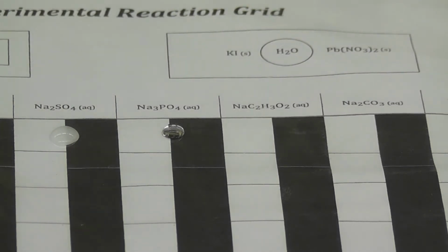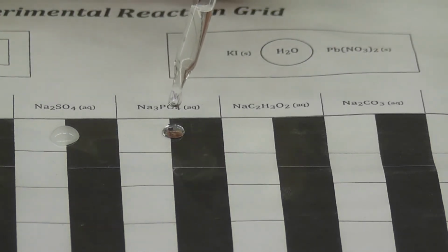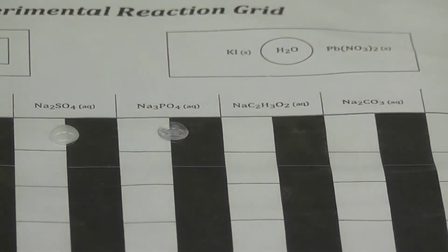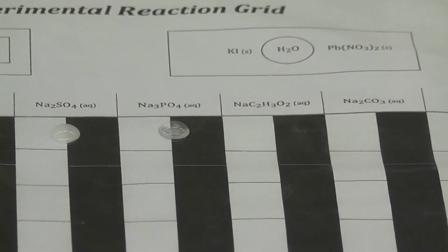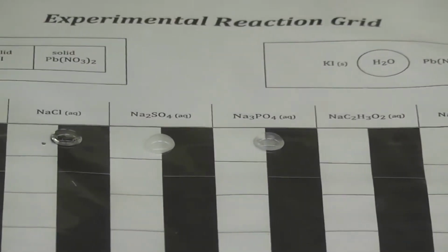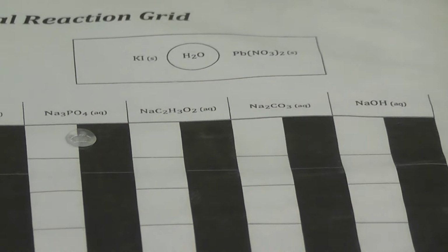And then this time we're using the sodium phosphate. So now I'm going to add 1 drop of sodium phosphate to the lead-2 nitrate. 1 drop. All right. Looks like there was a small thing inside if you look closely. Okay. Still continuing. We have a few more with the lead-2 nitrate.